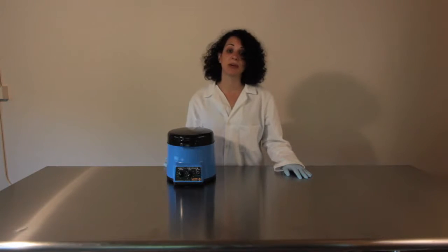The Bullet Blender 5 can be used for the homogenization of tissue samples up to 1 gram in size and homogenization of cell pellets up to 750 microliters in volume.